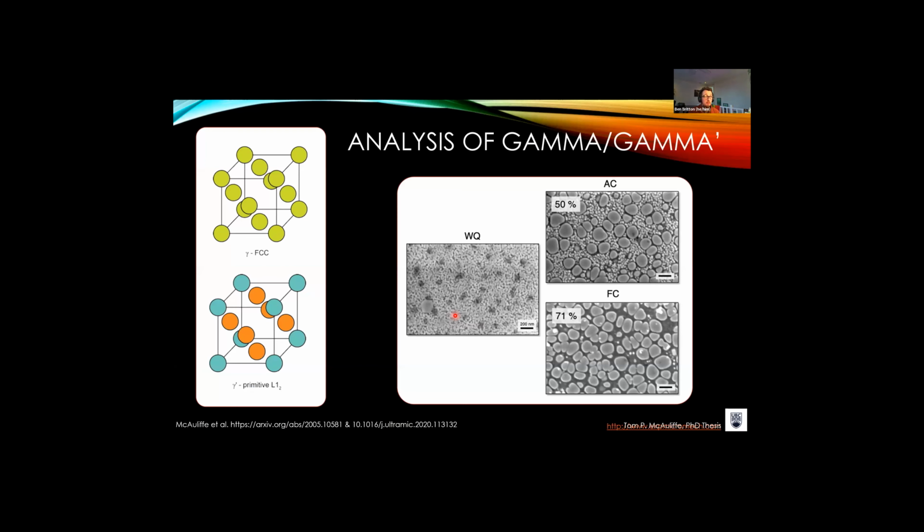So the problem we're looking at is, again, in the nickel system. In the nickel system, for superalloys, for aerospace applications, we're particularly interested in the ratio and spatial distribution of the gamma prime phase within the gamma matrix. We effectively have an ordered superlattice where we have an L12 structure, Ni3Al, where the nickel sites sit in the face-centered positions, and the aluminum sits on the corners. In the disordered matrix, there is effectively no ordering, and so we can swap those atoms around.